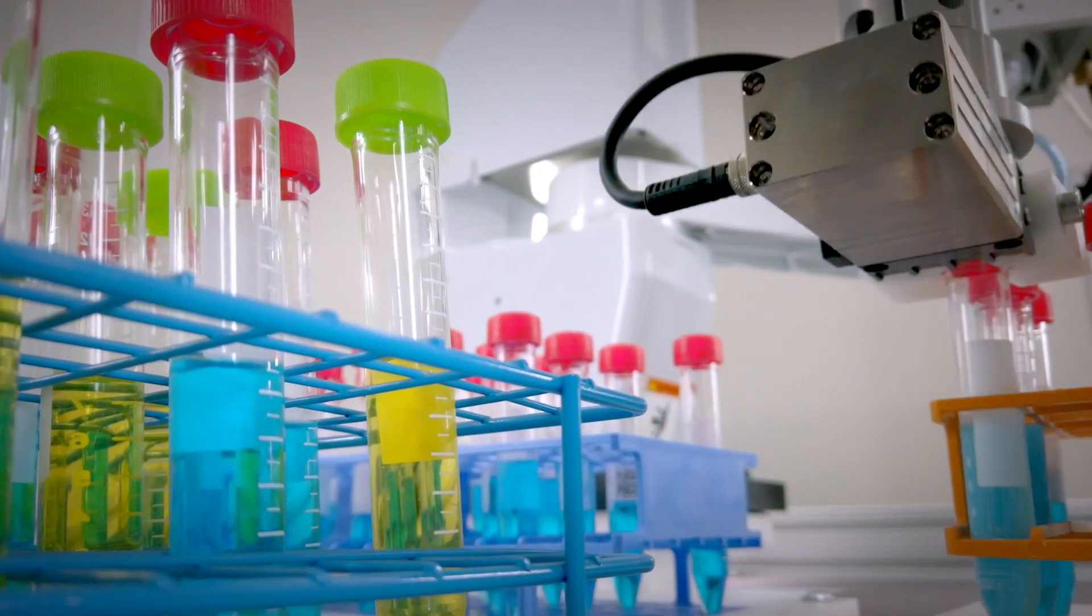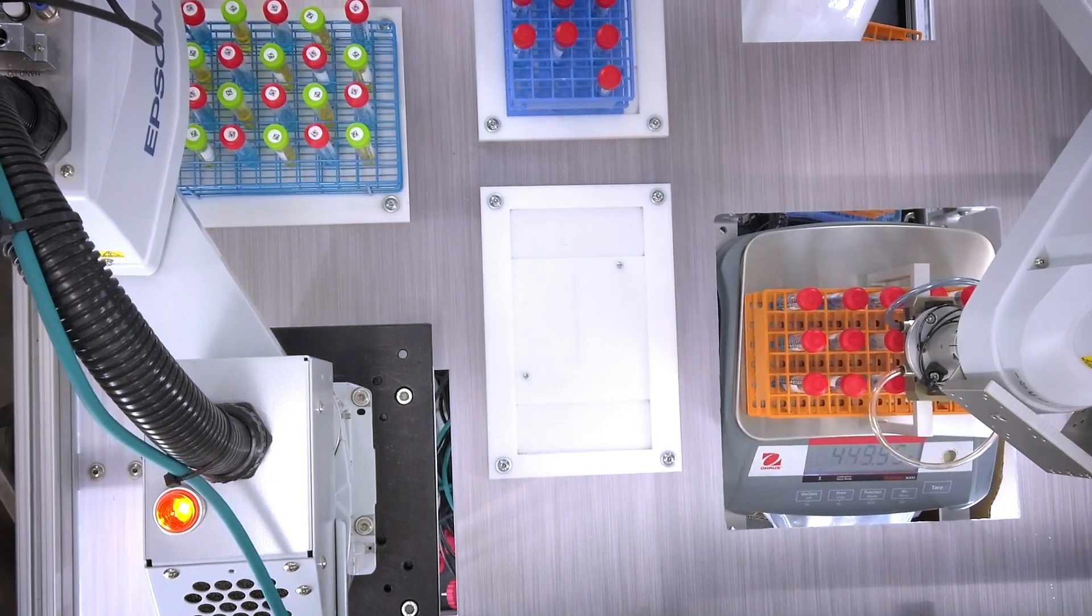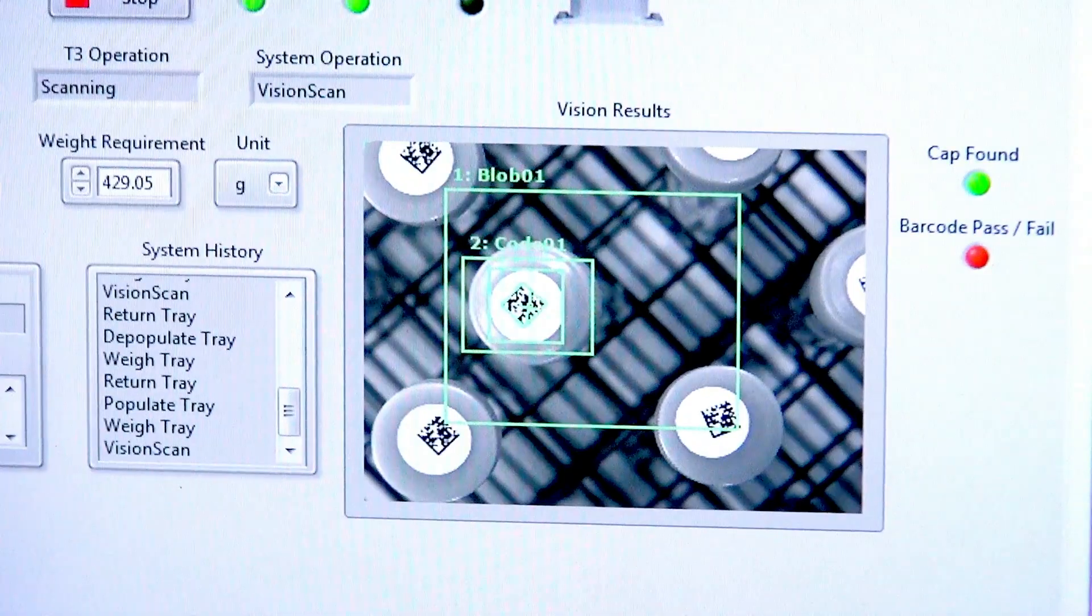The T6 takes the rack back to the scale and verifies that the rack is fully populated. Once the scale confirms to the system that everything is okay, then the T3 moves on to a vision inspection and vision-guided pick-and-place.